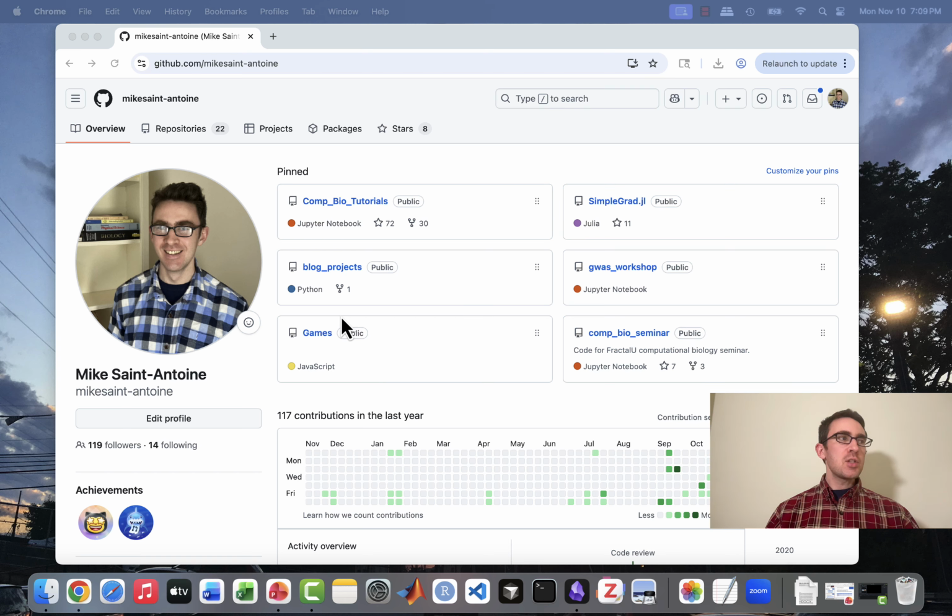So I made up a fake data set that gives us similar information to what a real data set would, and lets us do a somewhat realistic analysis.